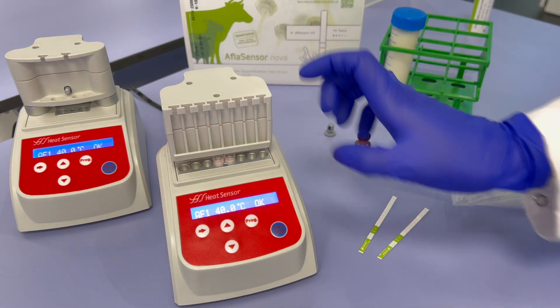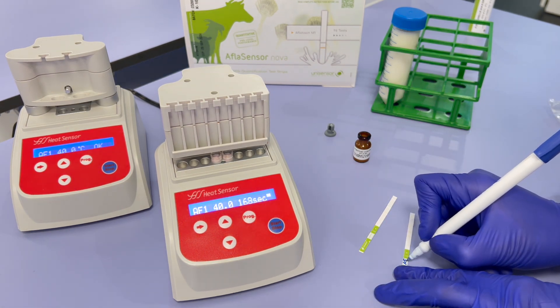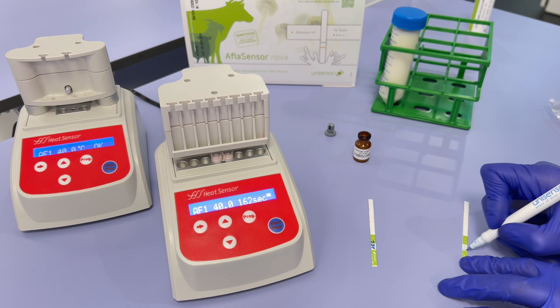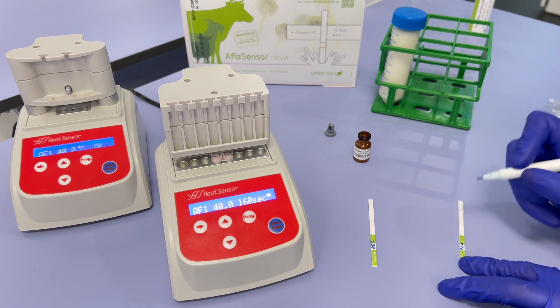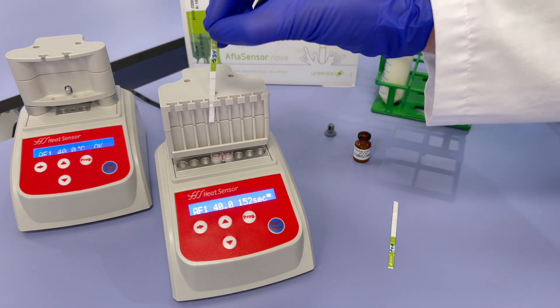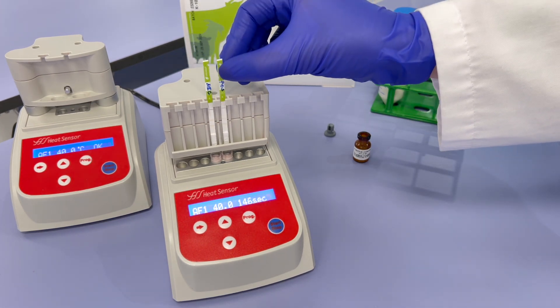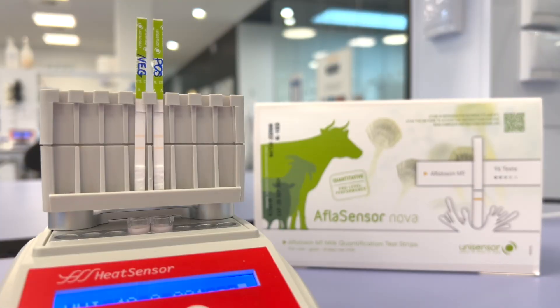First incubation: Close the device's lid and press the start button. The initial incubation of three minutes will begin. Identify all samples with a unique number or code. Testing more than six samples at once is not recommended. Place the test strips into the designated slots of the heat sensor, aligning with the corresponding reagent microwell containing the milk sample.